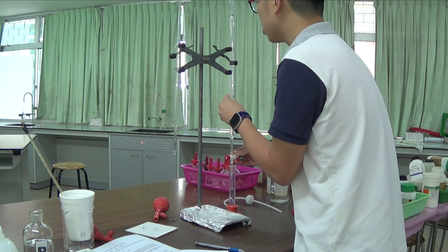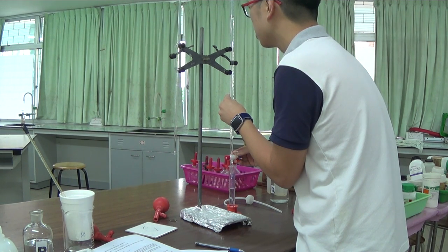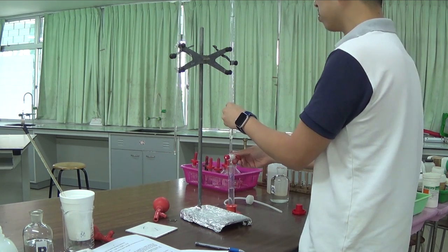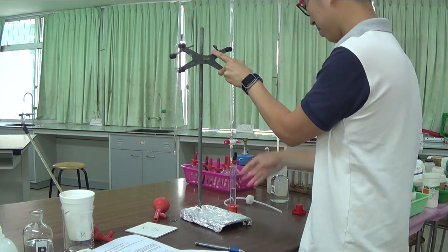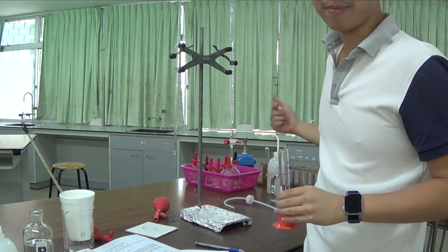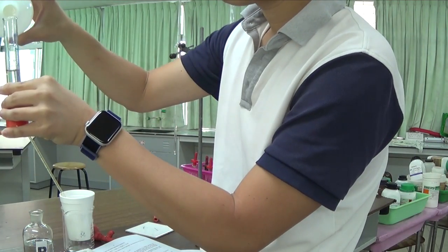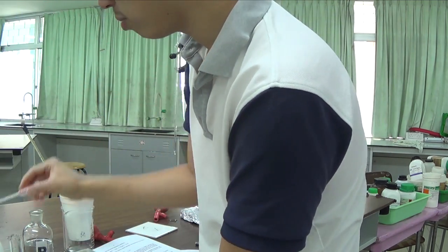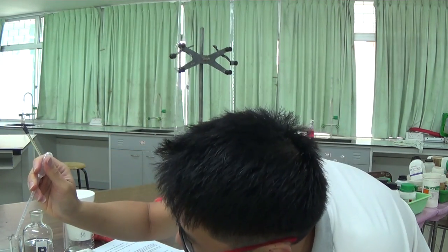Okay, so I'll drop my drop towards the end. So there's 18.00 cm cubed. Oops. Nearly overshot it just now. Okay, because I nearly turned my burette 360 degrees. So I'm gonna add some water. And I'll be careful towards the end. Use a dropping pipette.